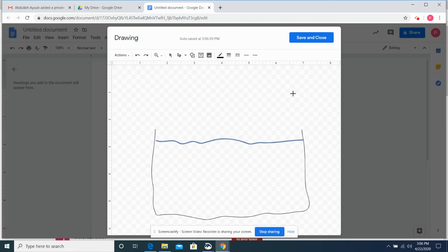Now, you know that an electrode is usually a metal piece with either a positive or a negative charge. All right, so the metal pieces, they're not going to be what you normally think of as a metal today. In fact, this won't be a metal at all. It's going to be a carbon electrode, but it will still have a positive on one side and negative on another side. It's going to be hooked up to a power source. You might think of it as being hooked up to a battery. You know that batteries have positive ends and negative ends. And so you might think of it as hooked up to a battery. It's the same thing, a positive and a negative end.